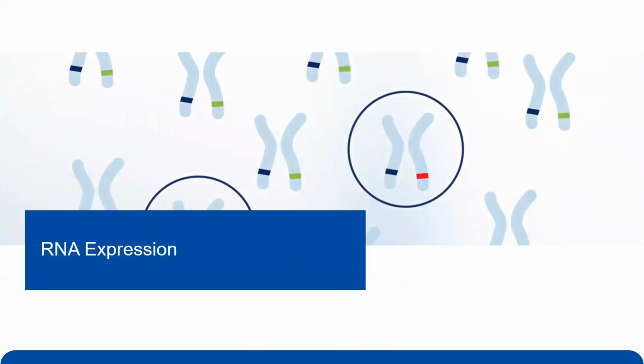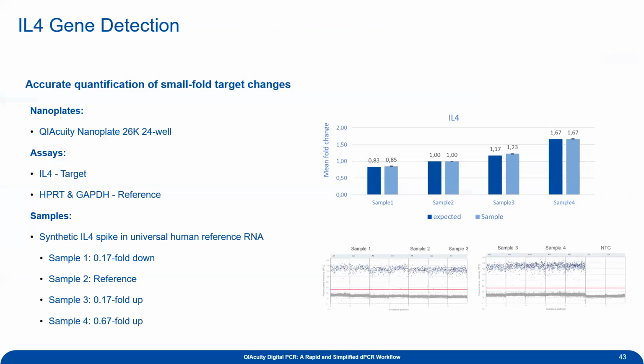So for RNA expression, which I believe is my last application here, let's say you have something in your qPCR reactions where you're basically beyond cycle 30. And this is going to differ for everyone if you're looking at low-level expression. Usually beyond cycle 30 or 32, you start getting your standard deviation starting to bloat. Oftentimes after cycle 35 is where qPCR reactions really break down.